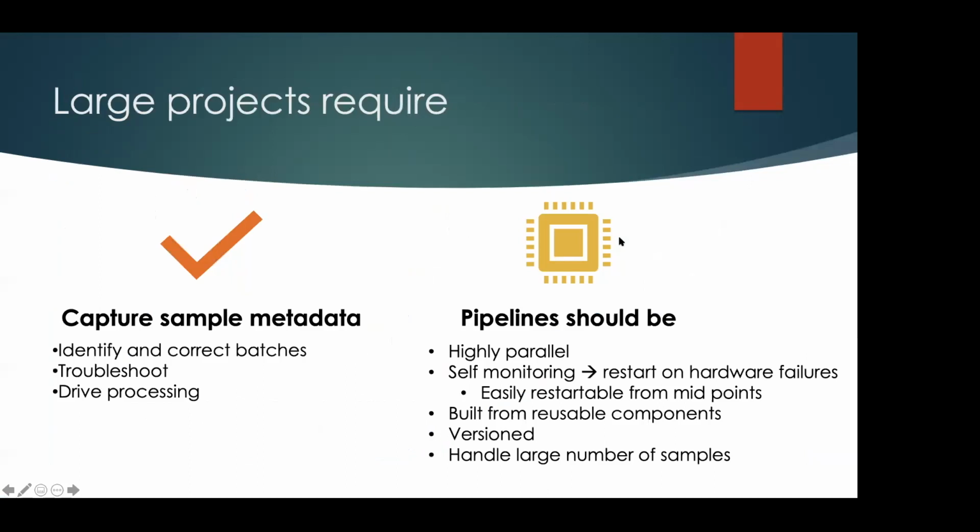So when you have large projects, those large projects have a couple of needs. They require capturing sample metadata. And in DolphinNext, we created a new thing called DMeta, Dolphin Meta, that I'm going to talk about. So you can actually keep all this metadata and attach it to your samples.